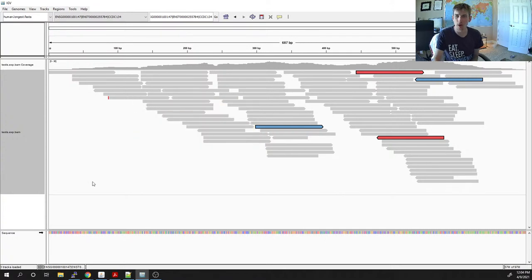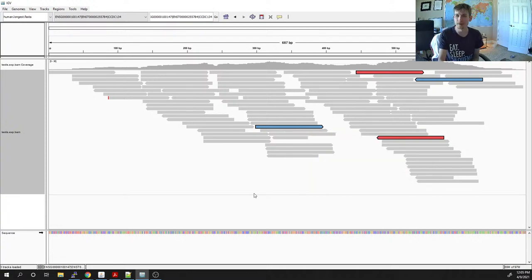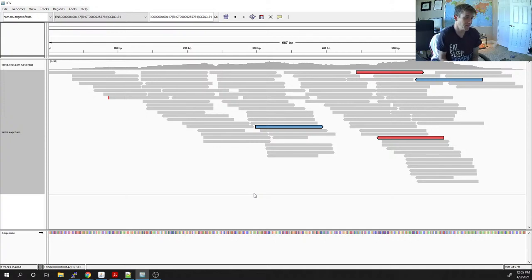This gene spans approximately 600 to 700 bases. Each of these gray bars represents a read from our RNA-seq library, showing where every read derived from this gene mapped to. The gray histogram on top is a coverage plot — where the most reads map. I have a couple of paired-in reads highlighted: the red ones are from one specific RNA molecule and the blue ones are from a different one.